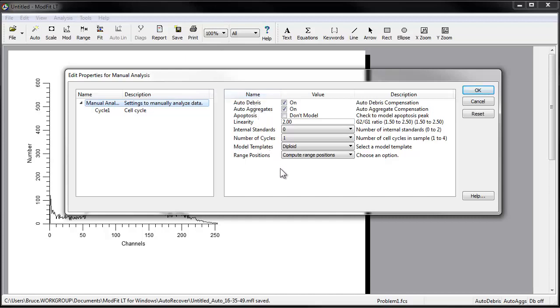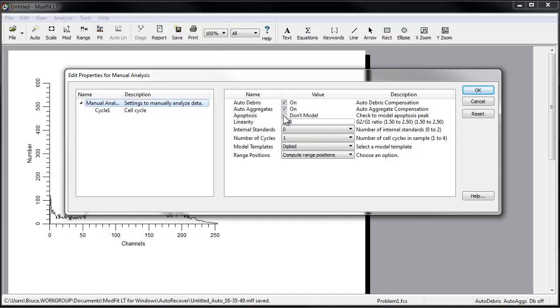This is a DNA aneuploid sample, so the selections we make in the dialog need to reflect that. We'll enable auto-debris and auto-aggregates by checking the related checkboxes. Disable apoptosis by clearing its checkbox.